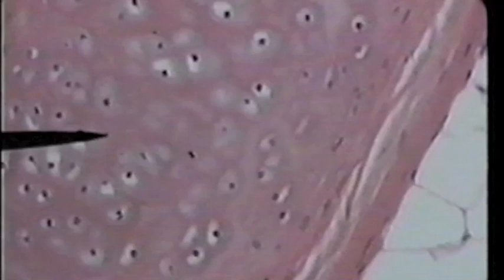Hyaline cartilage is recognizable because it does not have visible fibers in the matrix. In the matrix, we find lacunae. Lacunae are the spaces within which the cells reside. The tip of the pointer here is indicating a clear, round lacuna. That's not the cell — the cell resides within the lacuna. When this tissue was living, the cell completely filled up that lacuna.